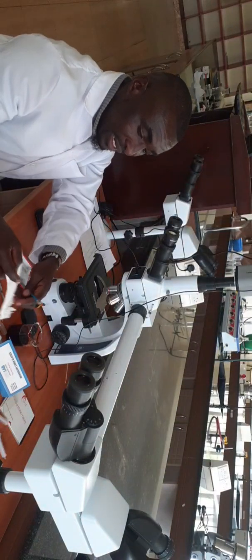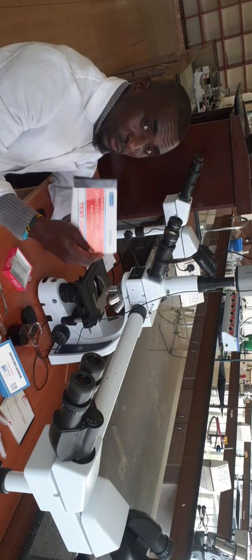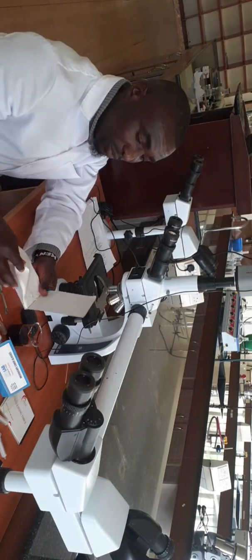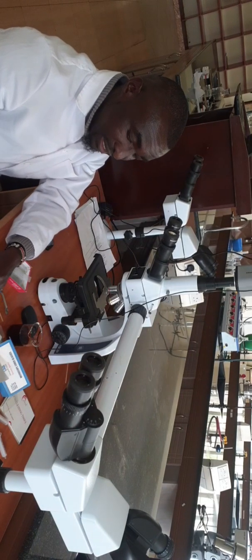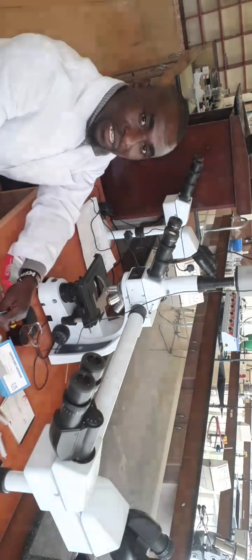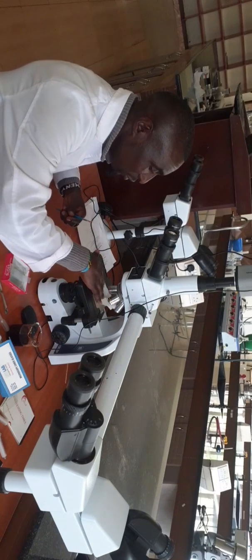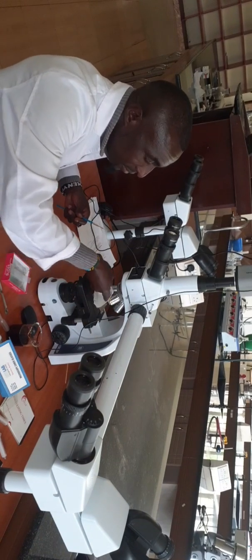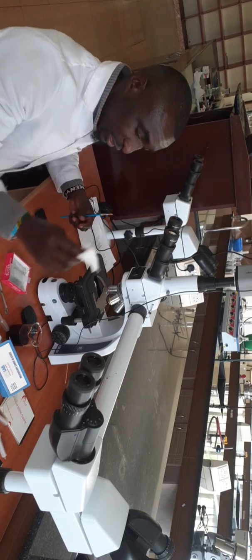This one is lens cleaning tissue. It is used for cleaning the microscope lens. So it is a very important tissue to ensure that your lenses are very clean. I can use it to clean the microscope lenses very, very well. So that is the function of this tissue.